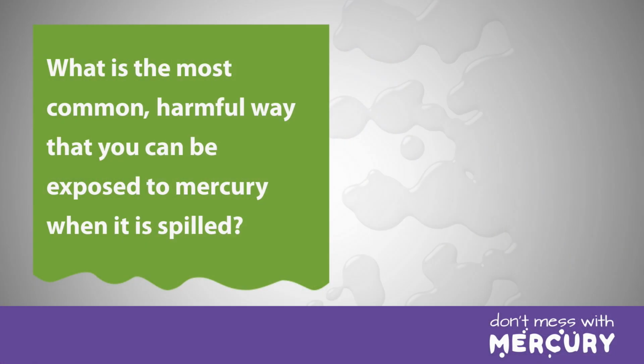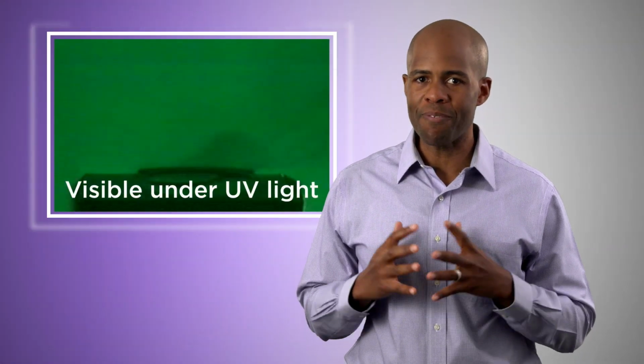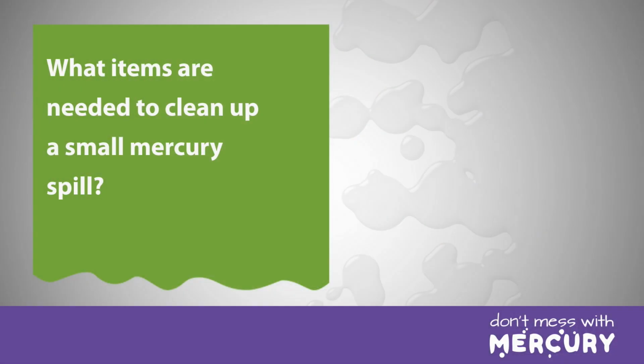First question. What is the most common and harmful way that you can be exposed to mercury when it is spilled? A. Mercury touching your skin. B. Breathing mercury vapors. C. Swallowing mercury. The correct answer is B. Breathing mercury vapor is the most common way to be exposed to elemental mercury and is the most harmful to your health. When elemental mercury spills, it vaporizes, becoming an invisible, odorless, toxic vapor that can be harmful to health when breathed.